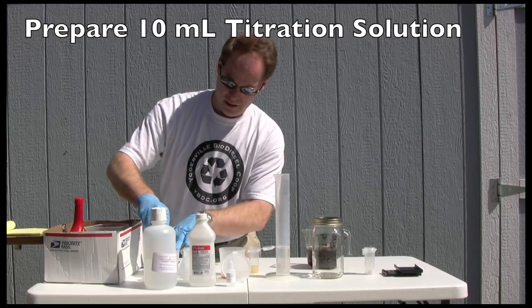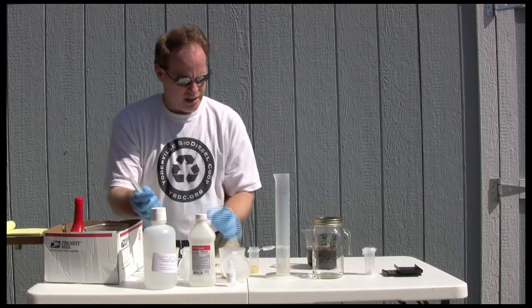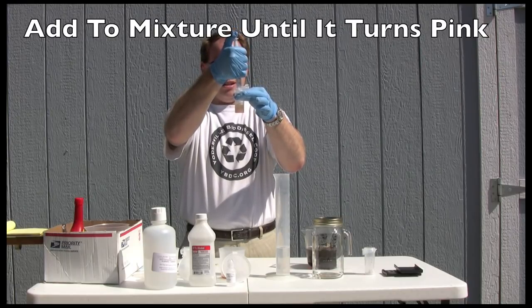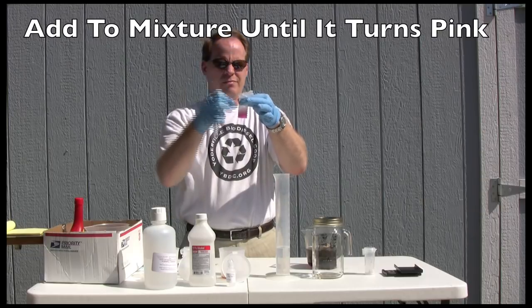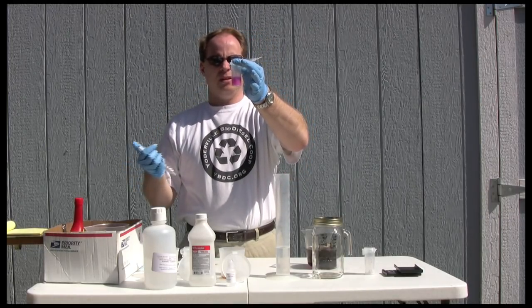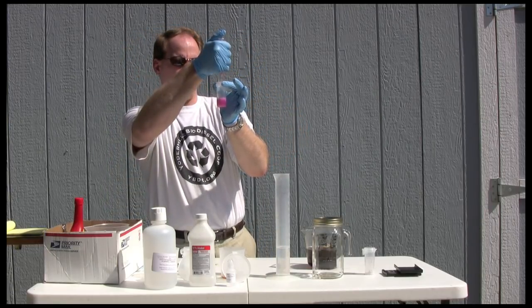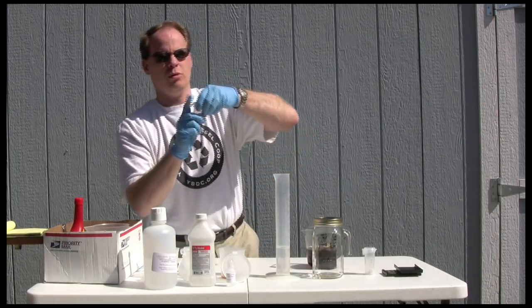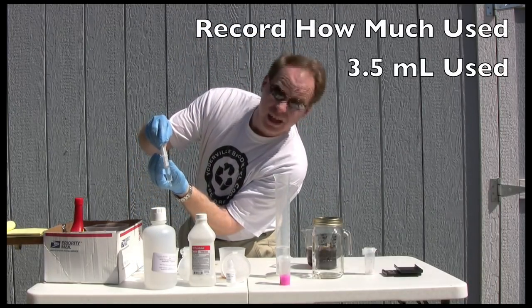To begin the actual titration, I take a syringe, fill it up with 10 milliliters of titration solution, and slowly my goal is to turn this pink. It almost turns pink on contact so this oil is pretty darn good. You can see that it's turning really nice — got a nice purple tint to it. Let it sit for about 30 seconds and see if it stays that way, then we'll add just a touch more. So that's titration number one — that came out at about three and a half milliliters.